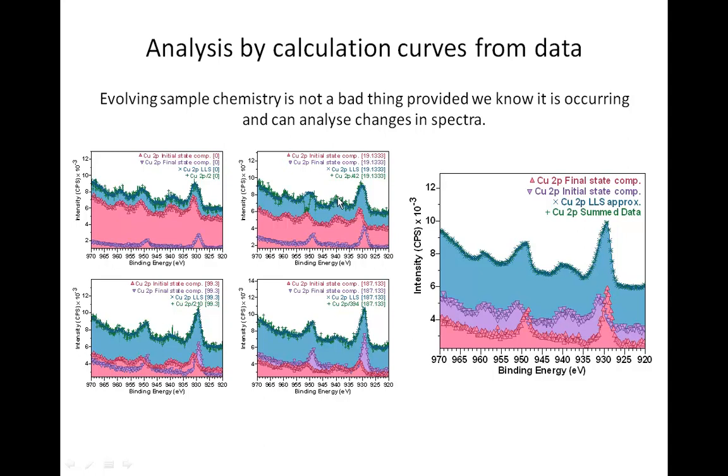Even though poor signal to noise, we have shapes that are sympathetic to these data, and therefore they fit the data rather well. And when we go to the total spectrum, this is the spectrum that is the sum of all of the copper 2p spectra, the same two shapes fit this again.